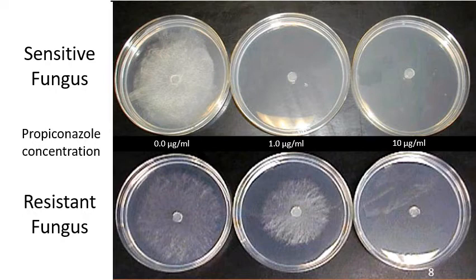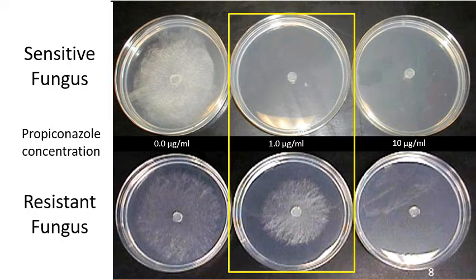The first objective was completed in the fall of 2020. In short, we began by reviving several isolates of the dollar spot fungus with varying sensitivities to DMIs. We then prepared an array of growth media that was amended with increasing concentrations of propiconazole to determine a concentration of propiconazole that inhibited the growth of sensitive isolates of the dollar spot fungus while allowing resistant isolates to grow.